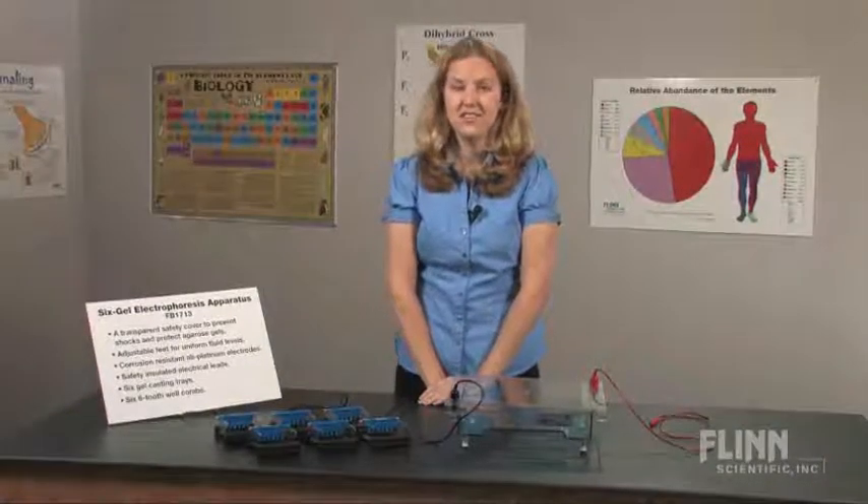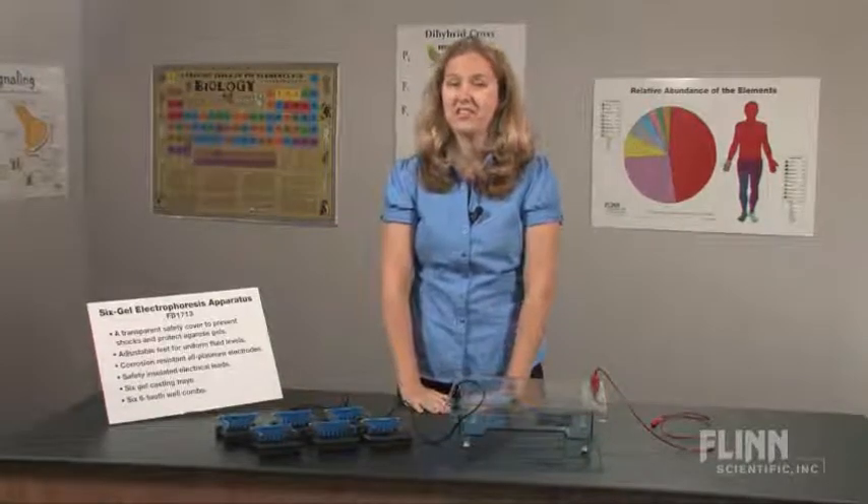Explore a variety of biotechnology experiments using the six-gel electrophoresis apparatus.